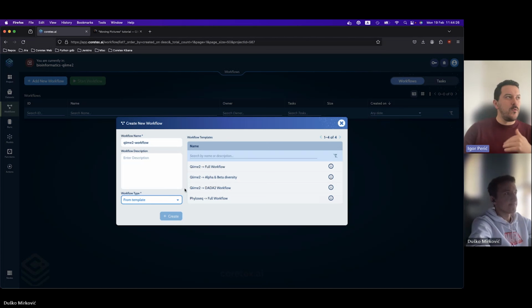And we are working day to day with our partners to expand this list of curated, typical, commonly used tasks. Those are like micro units that are part of the workflow as individual steps. We are making them modular, so they can be reused no matter what you want to do. You can take a couple of steps only from a workflow, link them together, and execute only this piece if you want.